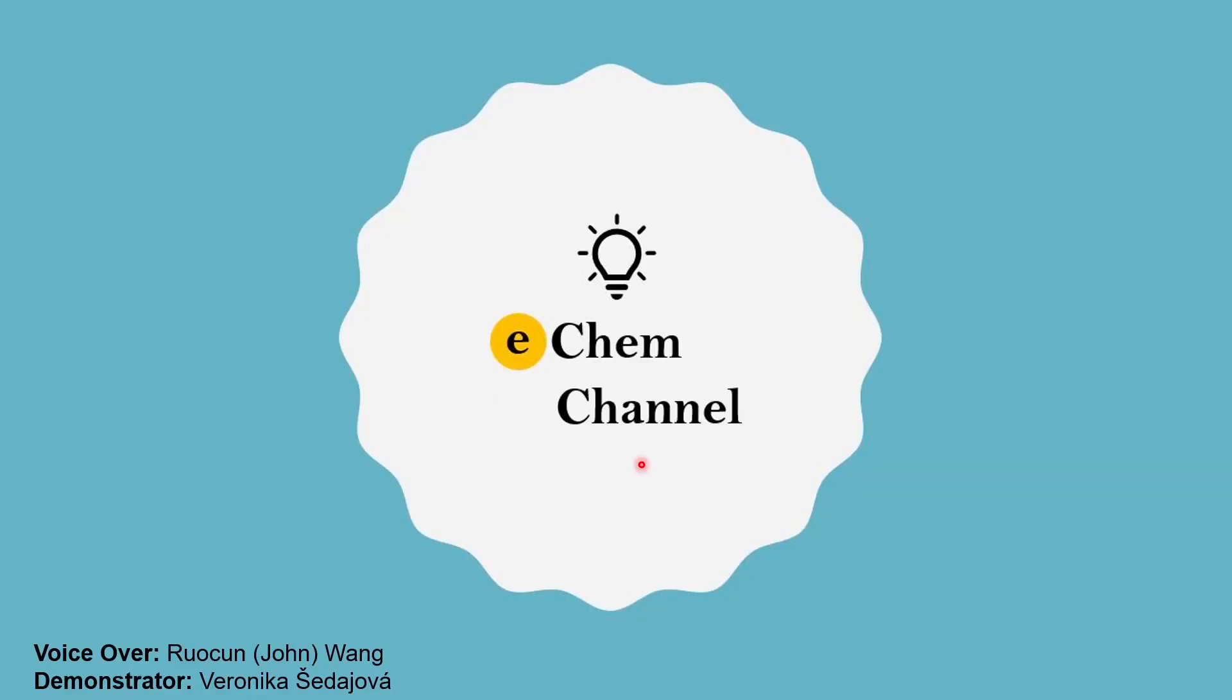I hope this demonstration helps you learn a new experimental setup to perform electrochemical characterization. If you have any questions, please leave them in the comment section below. Many thanks to Veronica Sediapova for performing this demonstration. She is currently a visiting scholar in the nanomaterials group at Drexel University.